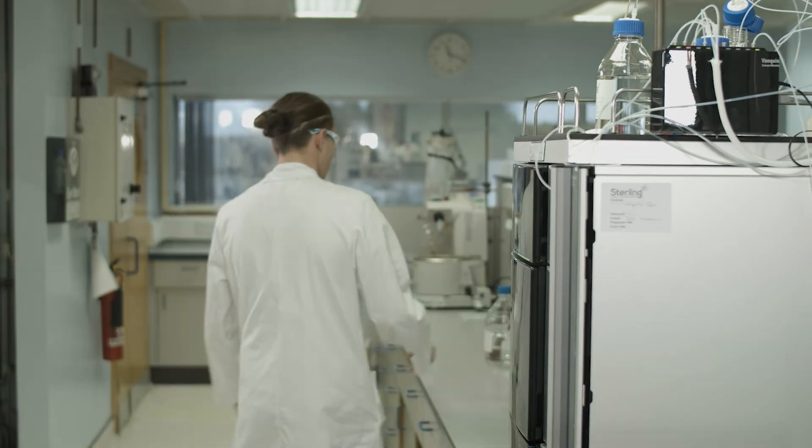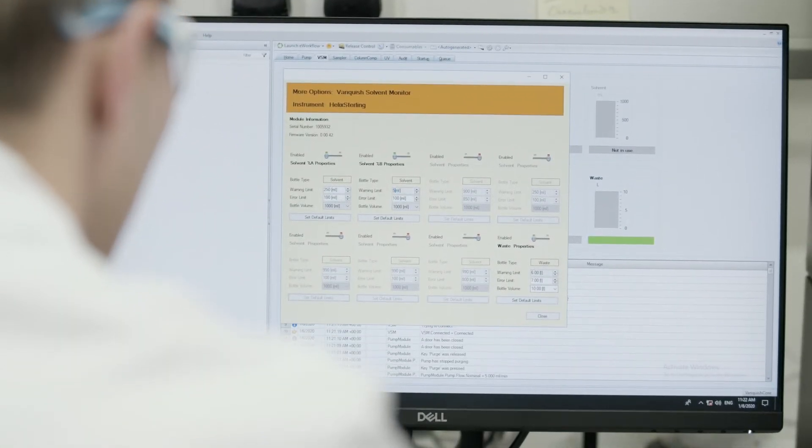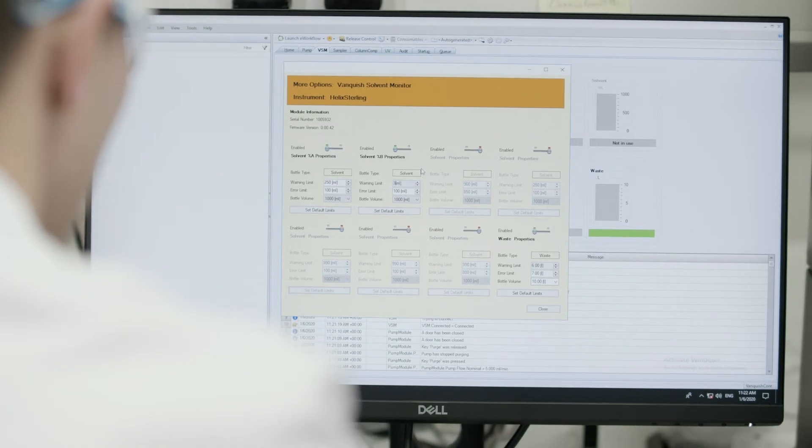The Solvent Monitor is a very useful tool. For example, if you don't have enough mobile phase to last your run, the Solvent Monitor will tell you and won't let you perform that run until you top up the mobile phase to an appropriate level.